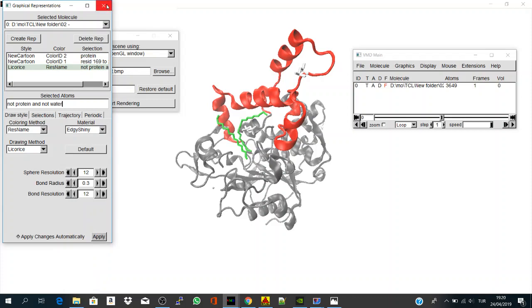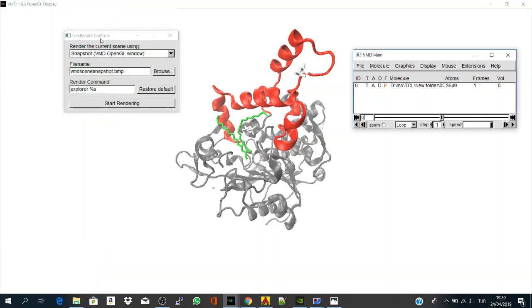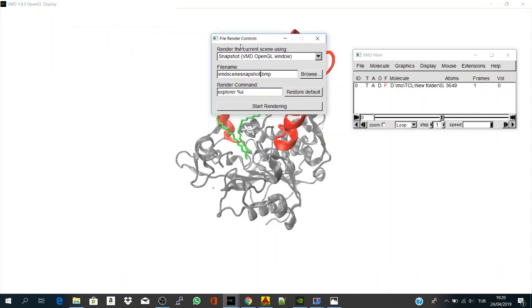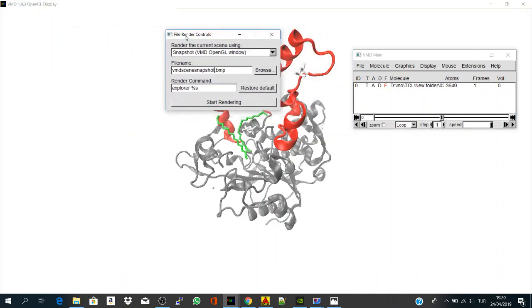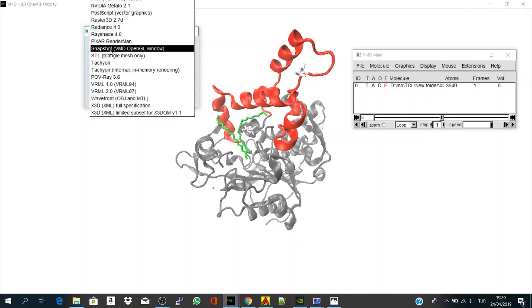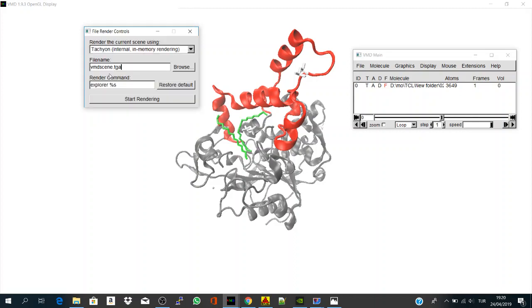And the main thing is, you change your rendering tool. By default, as I said, they are using snapshot, but this is not very nice, and I prefer Tachyon. It will give you a TGA file format, but higher quality.